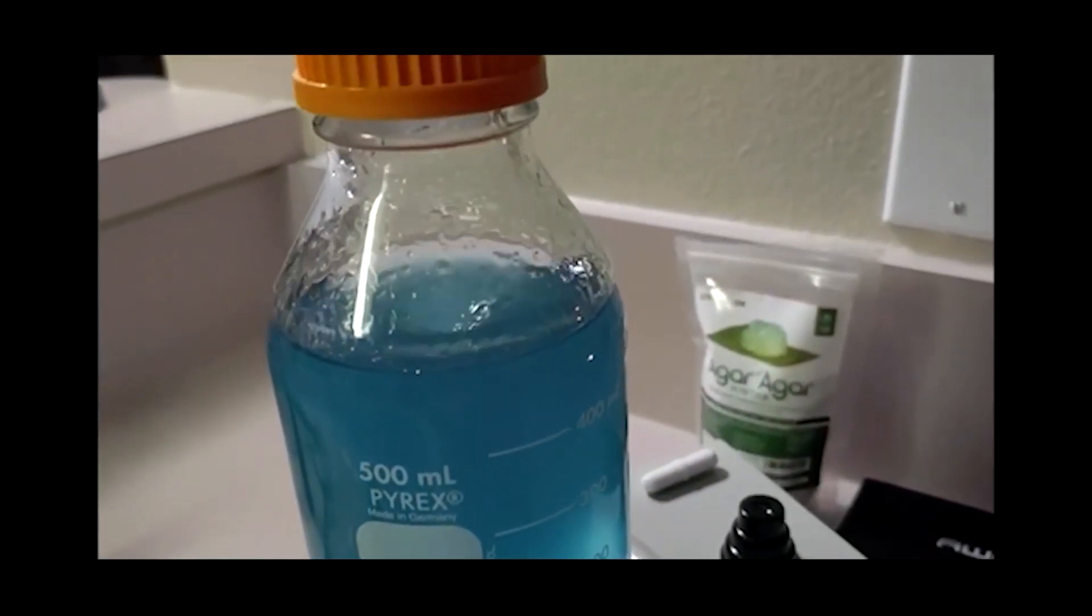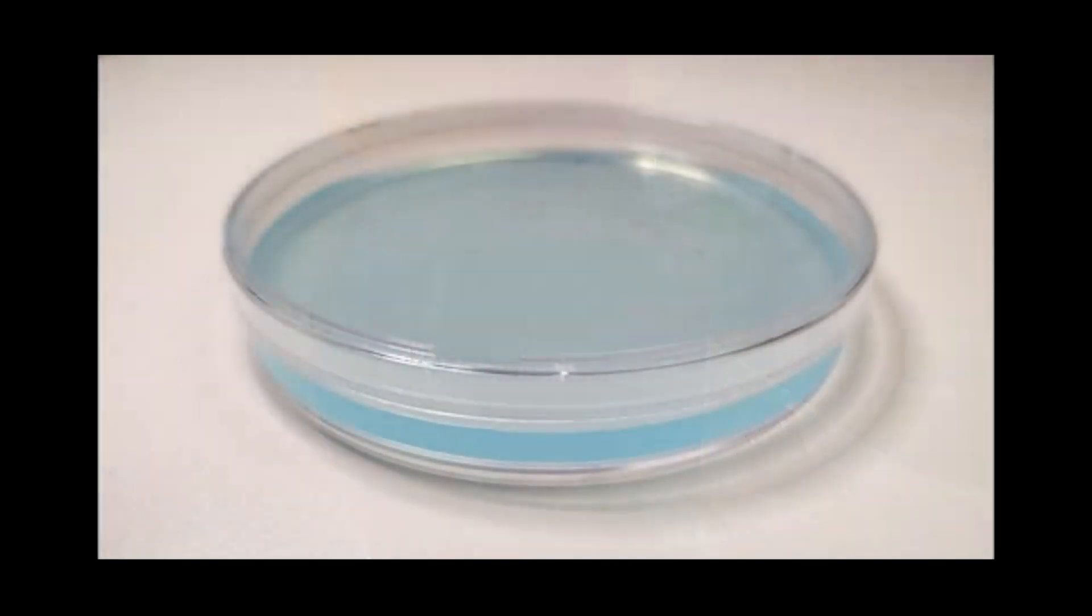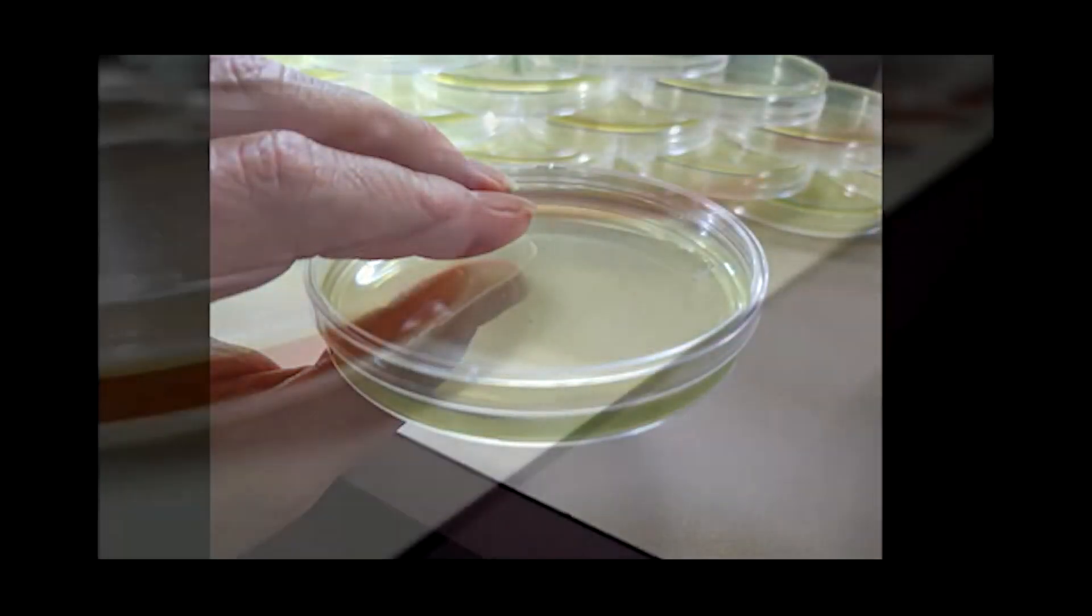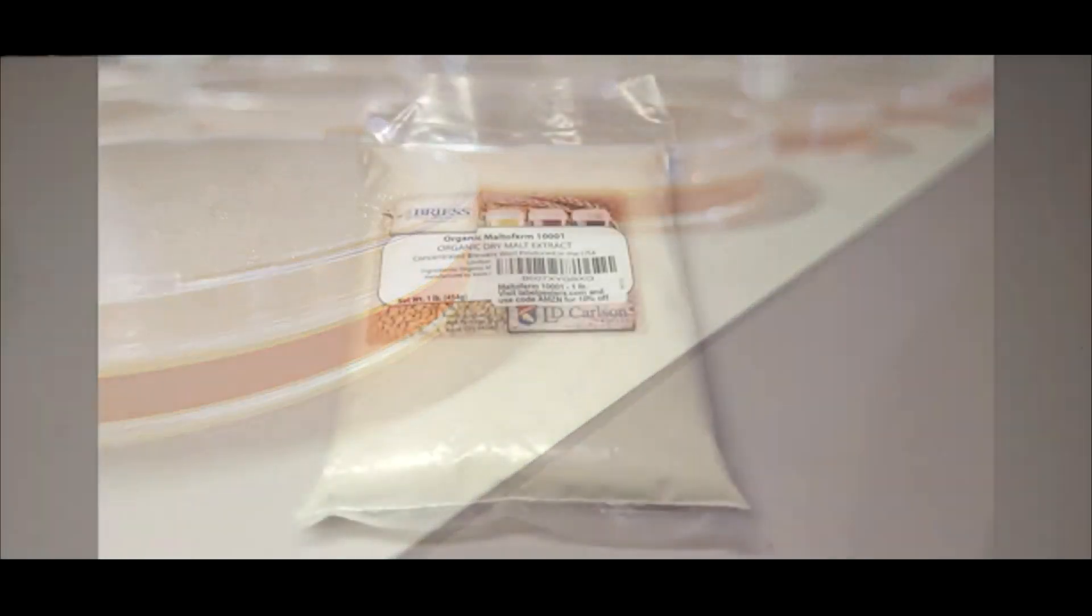When cloning or working with spores, we have found water agar to be the best recipe to start with. We then transfer to MEA plates, then a final transfer to MYA gives us the rhizomorphic growth we desire. There seems to be some confusion around malt extract and light malt extract.